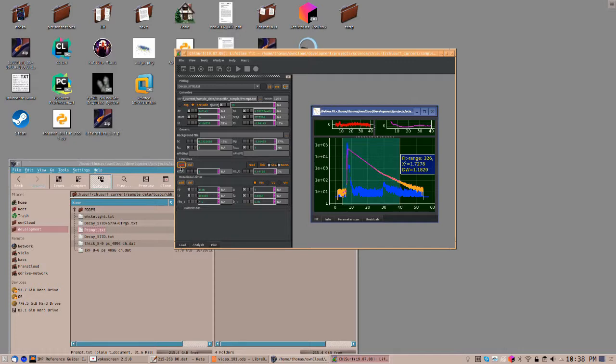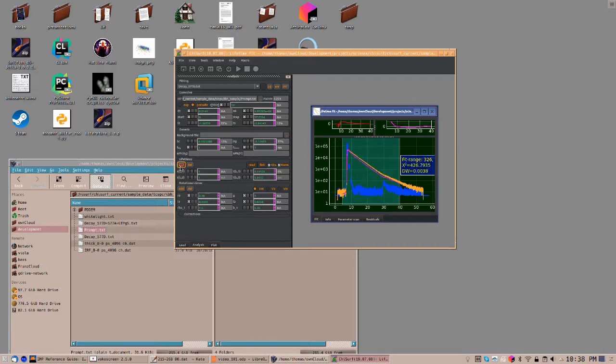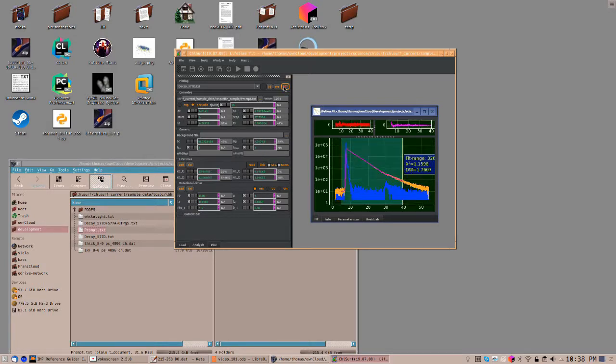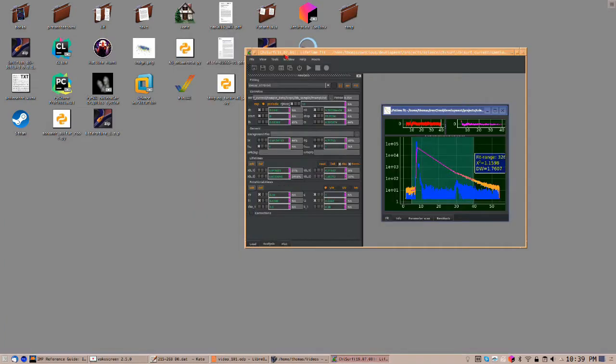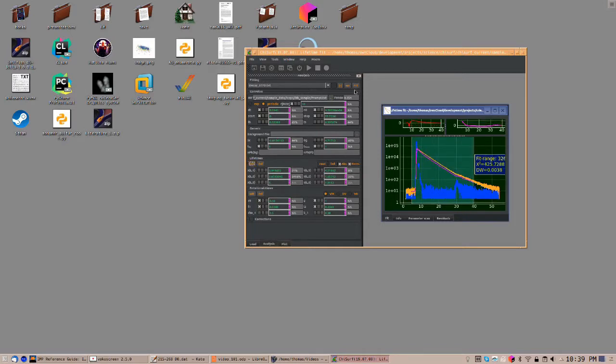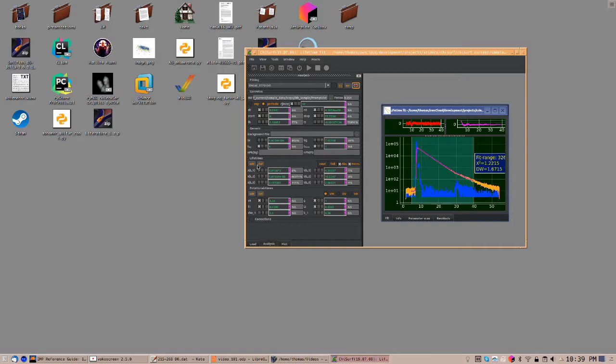You can add a fluorescence lifetime component by clicking on this Add button. Now click on Fit again to optimize the model against the data. This fit is already better, but not perfect.